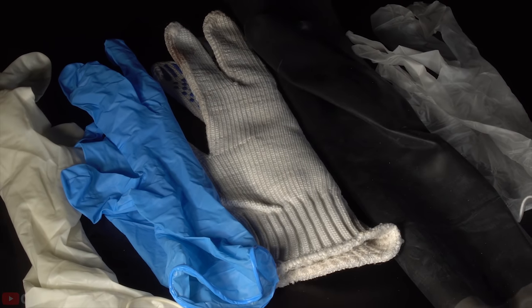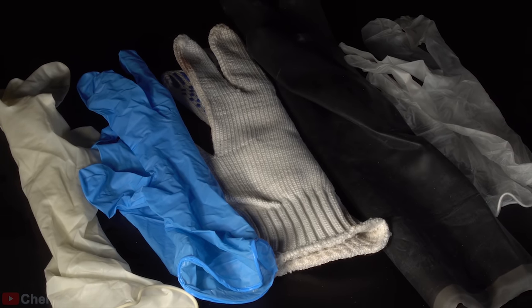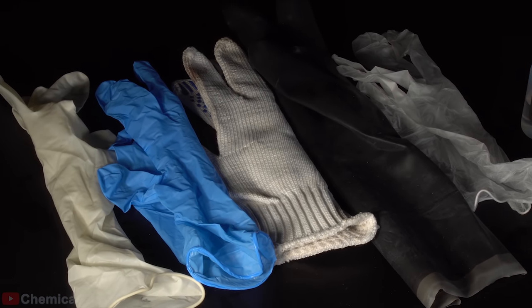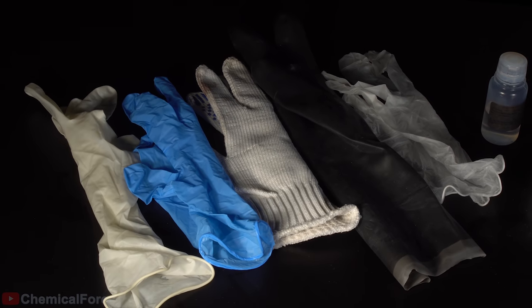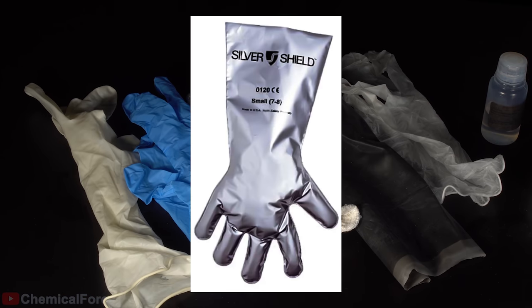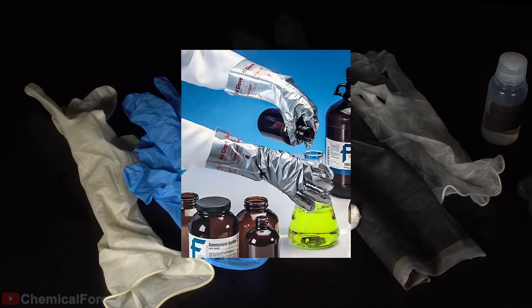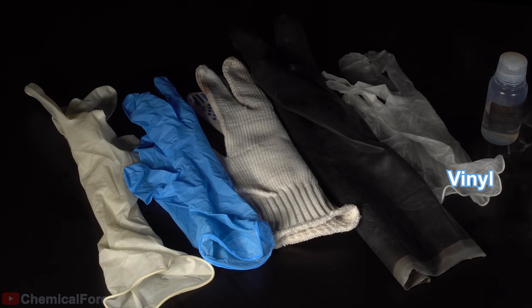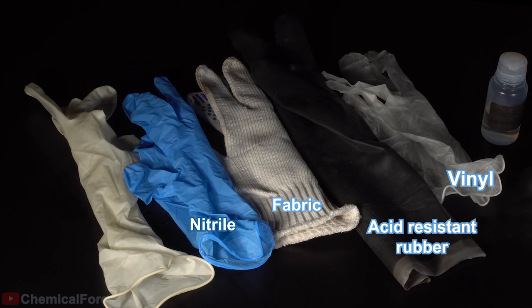So guys, now we need to figure out what material the gloves should be made of to use the strongest acid for the upcoming experiments. Actually, it would be nice to use silver shield gloves. Maybe one day I'll tell you about them, but now I prepared the most widespread types of gloves for the test, which are vinyl, acid-resistant rubber, fabric gloves, nitrile and latex. When superacid interacts with vinyl gloves, they blacken and bubble. Maybe it's not the type of gloves one should use to operate with it.